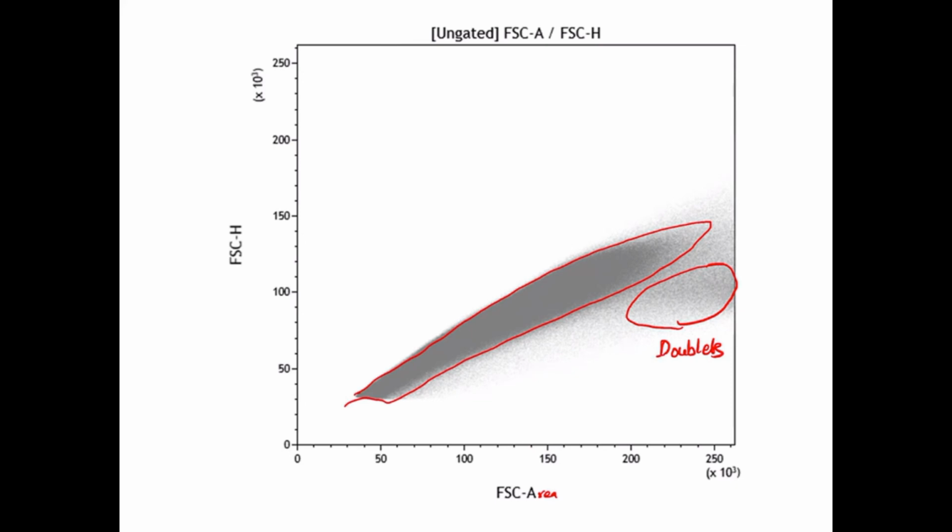As soon as we start analyzing any case in flow cytometry, the first thing that we do is exclude the doublets. And why do we exclude these doublets? Let's say, for example, a B cell and a T cell are sticking to each other and we are trying to study the fluorescence pattern in them. How that fluorescence pattern is studied, I'm going to come to in the next slide, maybe the next to next slide. Now let's say the B and T cell are sticking to each other, and when you analyze this, the cell will give you both a B type of signal and a T type of signal, and we don't want that. That may cause confusion in understanding the immunophenotype of the cell, which is our primary objective.